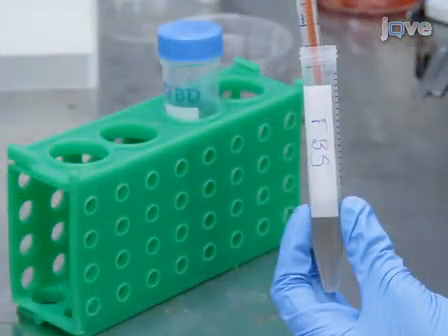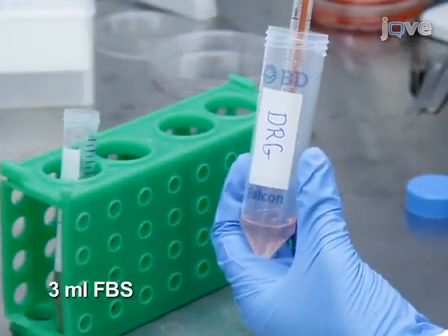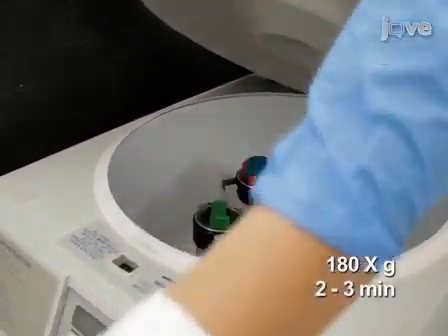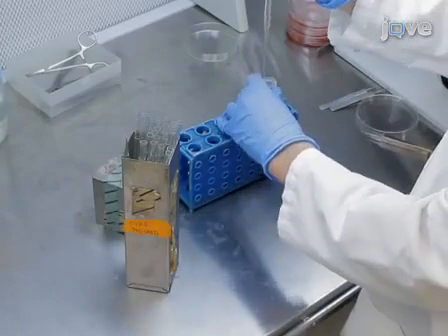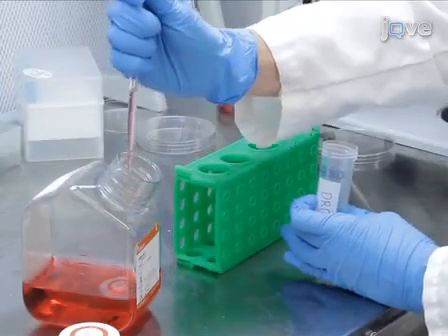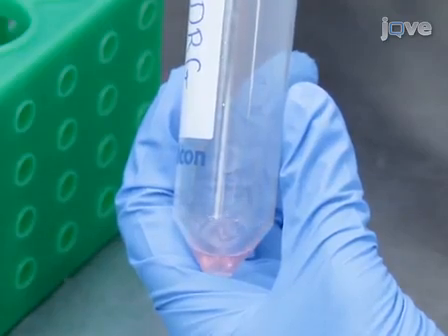After 10 minutes, remove the tube from the water bath and add 3 ml of FBS to the tube. Centrifuge at 180 times gravity for 2 to 3 minutes to repellet. In the meantime, coat a fire-polished Pasteur pipette with FBS as before. Use the FBS-coated pipette to add 1 pipette full of L15 to the pellet and triturate gently until the solution is homogeneous with no visible clumps.